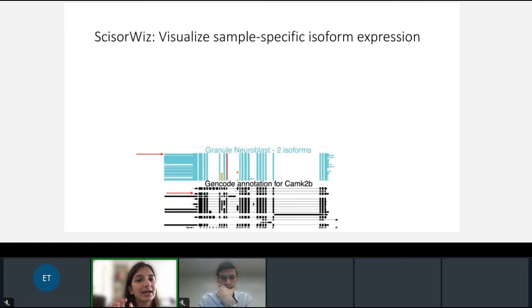That is something that can be customized if you go into the code and add in a couple of parameters. So for this particular example, you have one isoform that has this red exon. You can see the same for a different isoform, which has only this orange exon, and so forth, where you have this orange exon or both of them together.